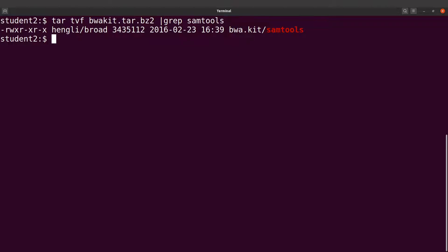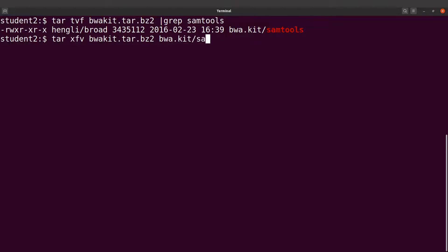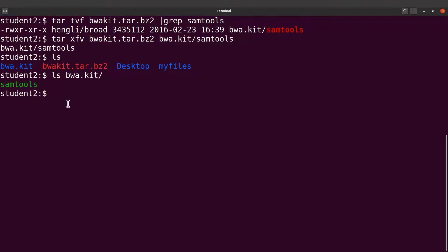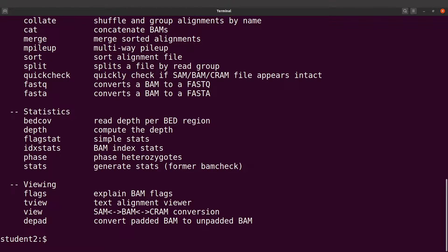Now let's extract the samtools binary. We say tar xvf, specify the file, and then specify the path — that is bwa.kit/samtools — and run it. This extracts only the samtools binary file. Do an ls and you'll see the directory there. ls into that directory and you will see samtools — that is what we need.